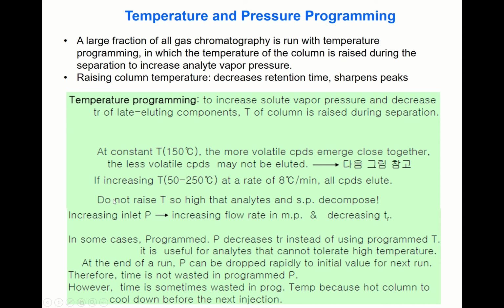But do not raise the temperature so high, otherwise the analytes and stationary phase decompose. Too high a temperature may cause decomposition of analytes and stationary phase.